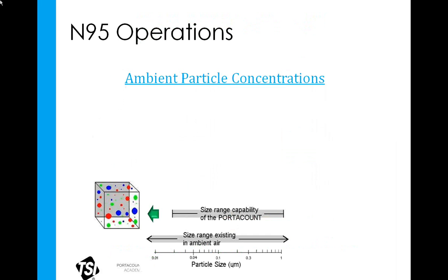So now we're going to all bring this back to the PortaCount. Okay, we're off the tangent. We're going to come back. And why is there this difference between the 8030 and the 8038? What makes the N95 companion different?